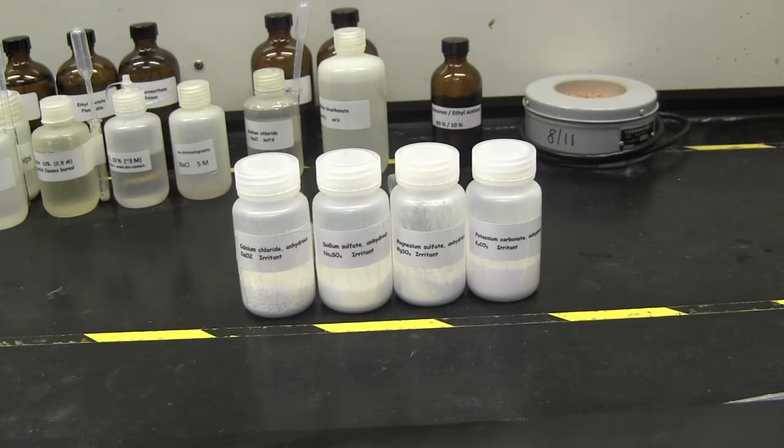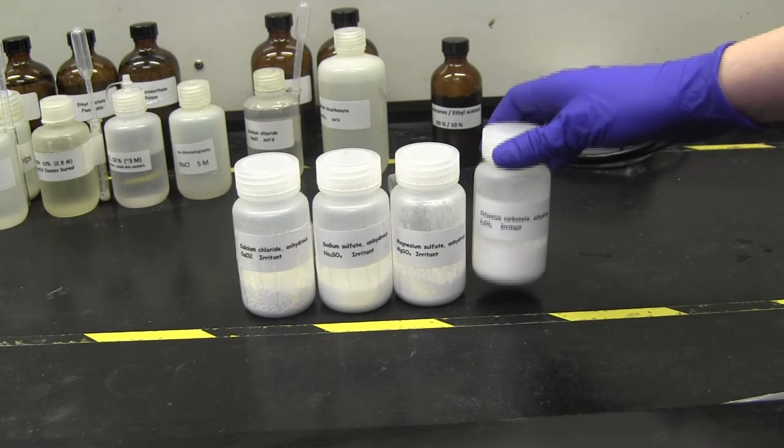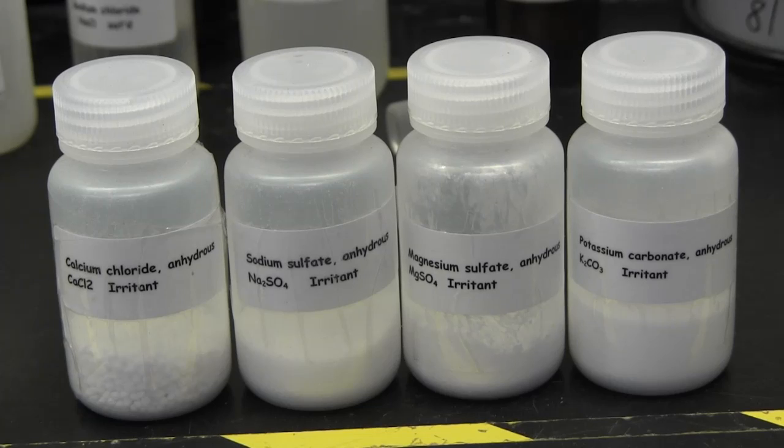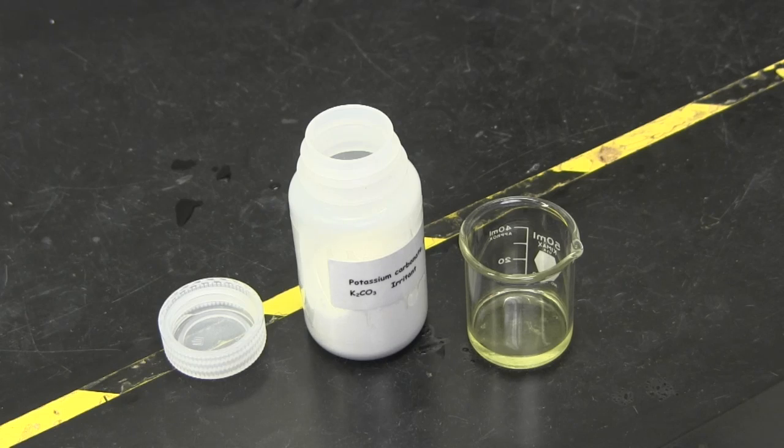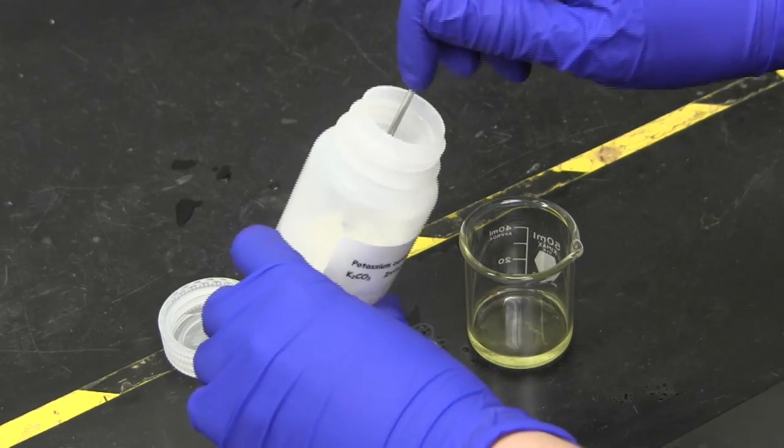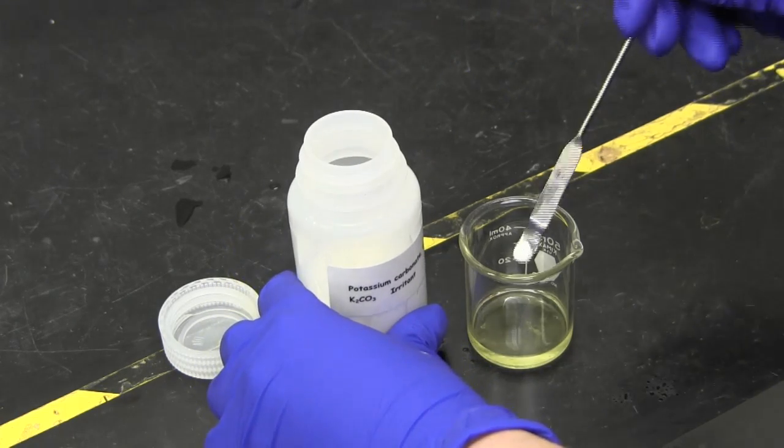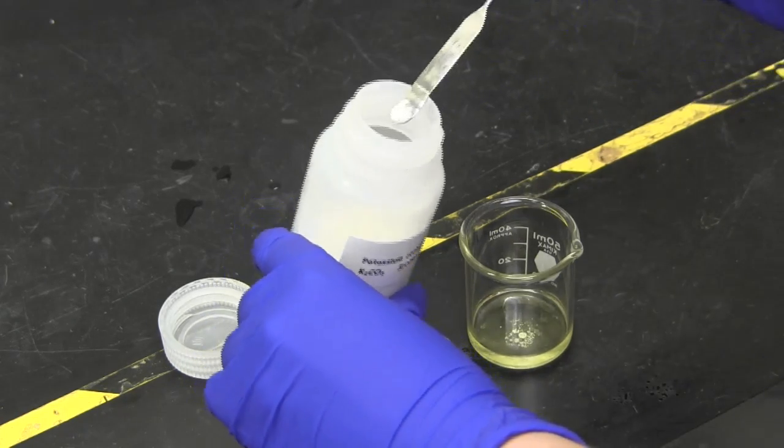Once you have your organic layer collected, add a drying agent. This will absorb any water in the solution. Drying agents include potassium carbonate, magnesium sulfate, sodium sulfate, and calcium chloride. Scoop small amounts of the drying agent into your solution to form a layer at the bottom. Allow it to sit for a few minutes.